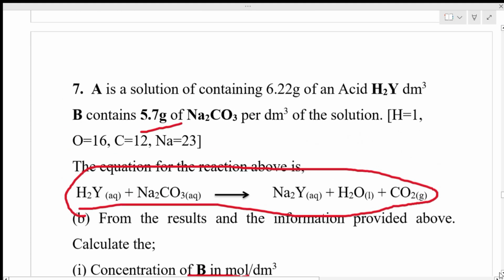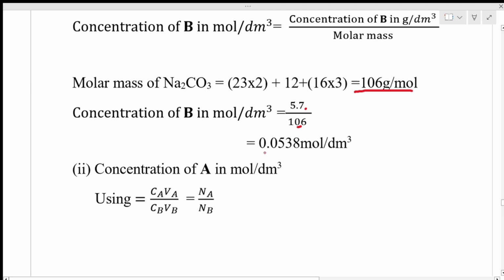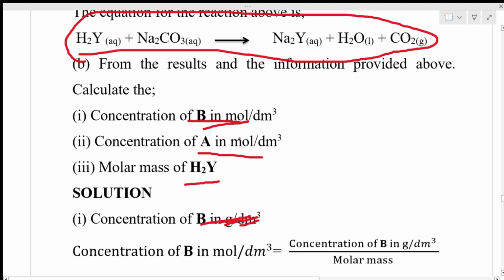Can you see it there? Then at the end of the day, you have 0.0538 mole per dm³.